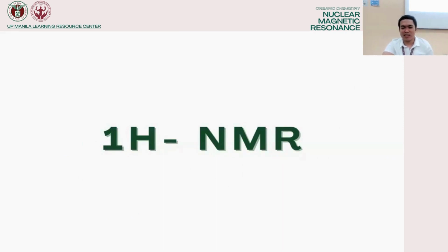So, yeah, we investigated hydrogen atoms, no? Okay, tama. So we focus on hydrogen NMR. Sige, let's have a review. Bakit natin gustong gamitin si hydrogen, this is protium, no? Sige. Let's go to the next slide.